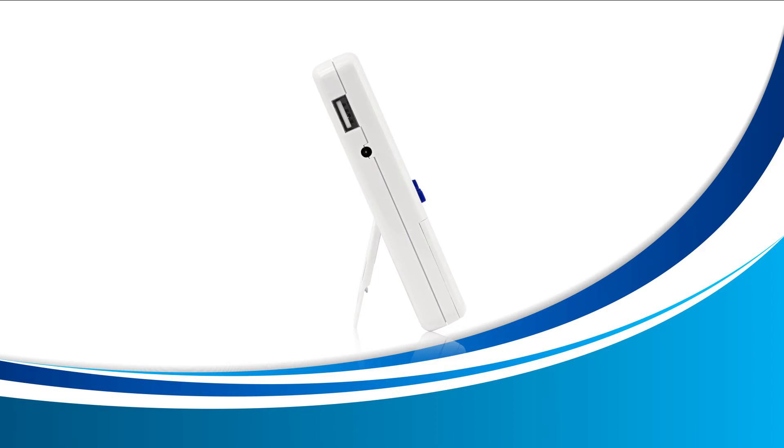The top square is for a USB device, and we'll learn about this in another video. For this video we want to focus on the small circle right below the USB input. This is where you're going to plug in your AC adapter.